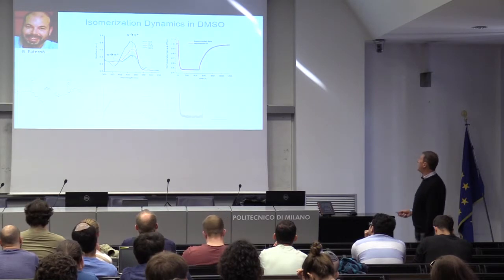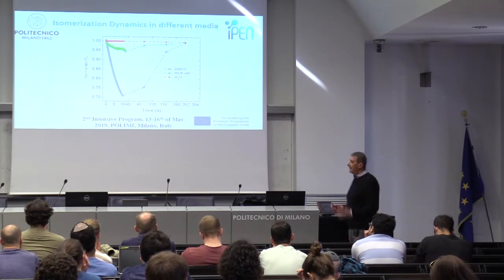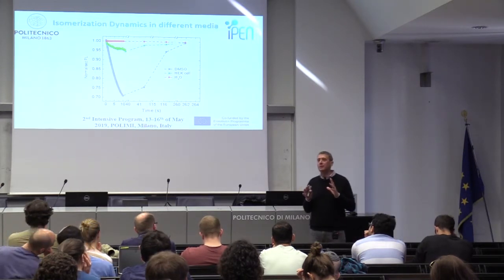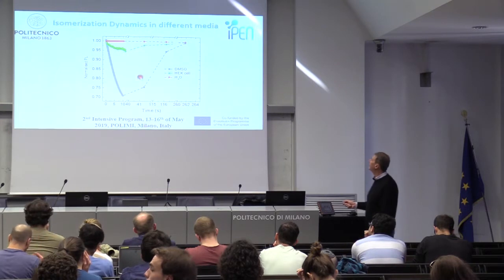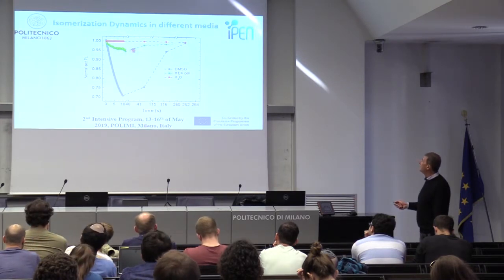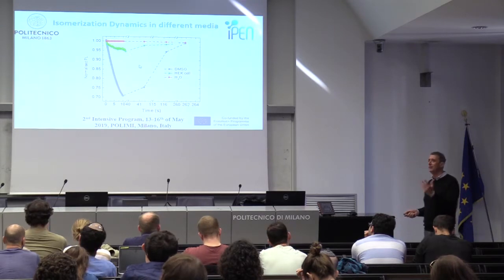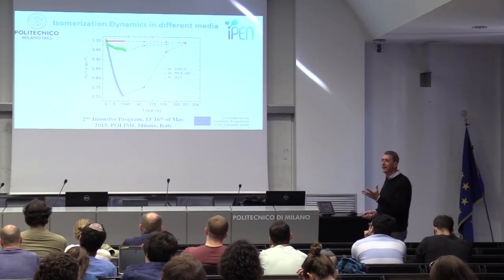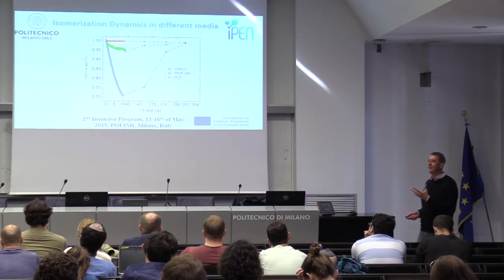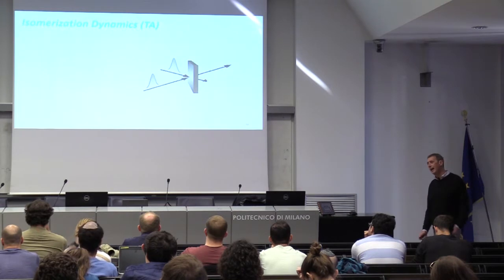All right. Now I have to speed up. What happens in this molecule is that when you put the molecule in water, the system is totally locked, and it does not rotate anymore. There's no more isomerization. When you put it in a good solvent, it is, however, isomerized. And what we do, we put them in the cell membrane in order to stimulate cells, and there they still move. Now the question here was, how long does it take to rotate the molecule? It's not the second that I showed you before. That is the population, the ensemble information. But the single molecule is much faster. How do we measure this?